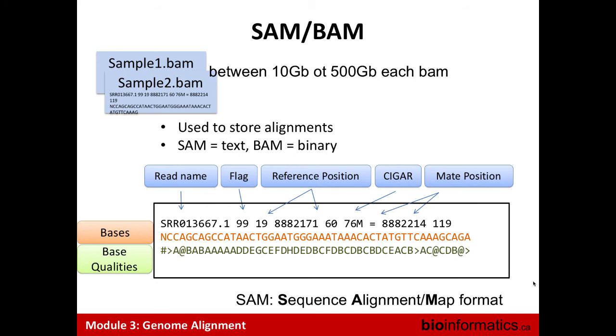But that doesn't mean that here I could have A, B, C, C, G, T, G, T, C, but my read could be like that. In that case, the aligner says the position is correct, but it's not a match in terms of being the same bases. So it tolerates having a substitution in the match. It's saying the right location is there, but it doesn't say that it is the exact same base as in the reference.